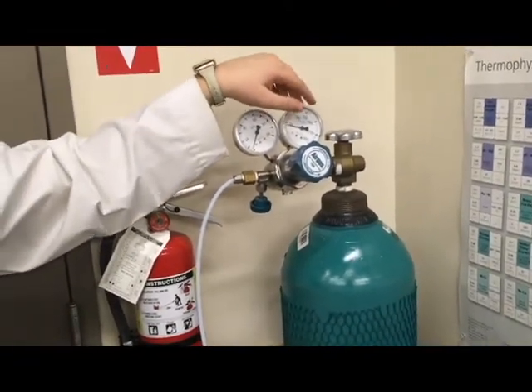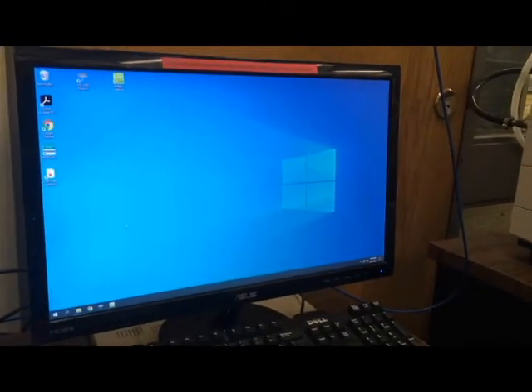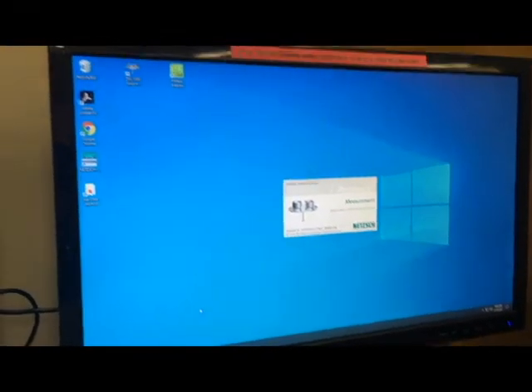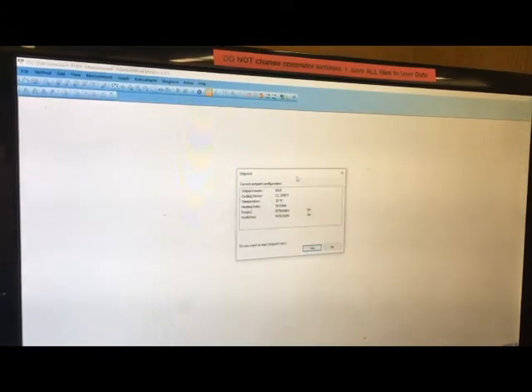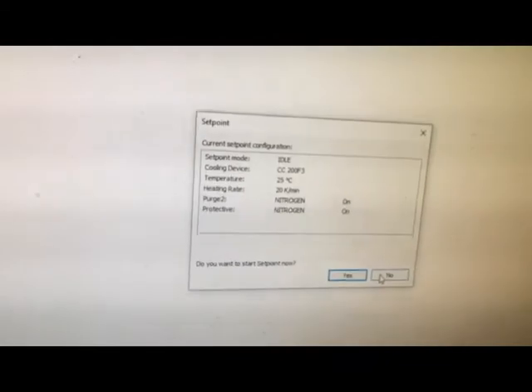This will be just fine for another day or two of scans. Now that I know my hardware is all set up, the machine's been warming up for an hour, I have enough compressed nitrogen, a full dewar of liquid nitrogen, and all my samples on the auto sampler card — I'm going to go into the software. It is called DSC 3500 Sirius. The first thing it's going to do is try to connect to the instrument. It's also going to offer to turn on the set point, whose purpose is to hold the machine at a uniform temperature — 25 degrees Celsius — as long as the software is open.